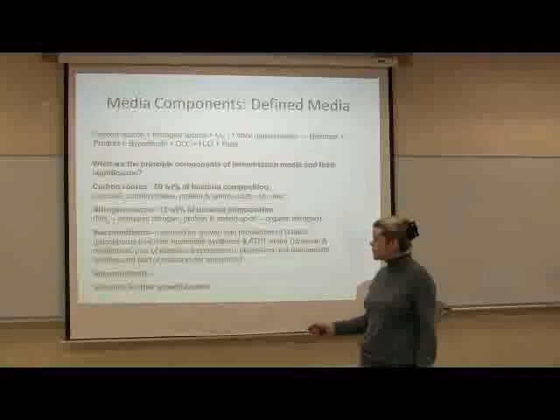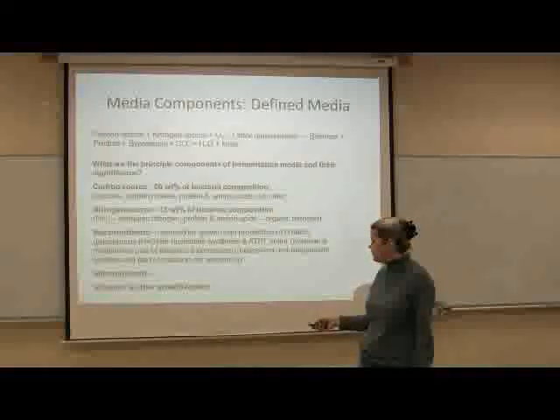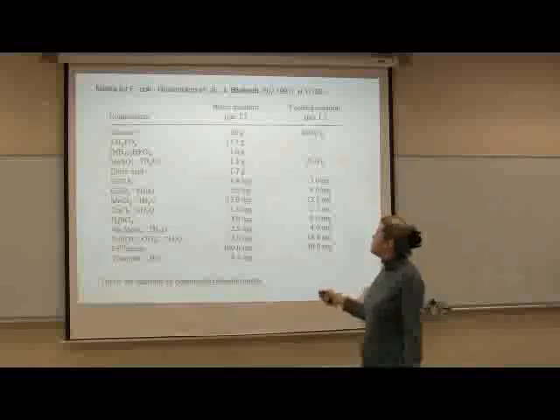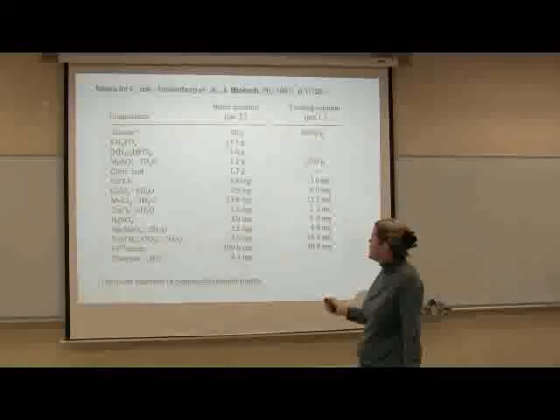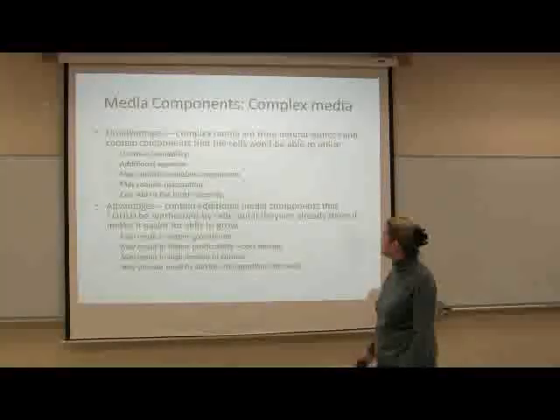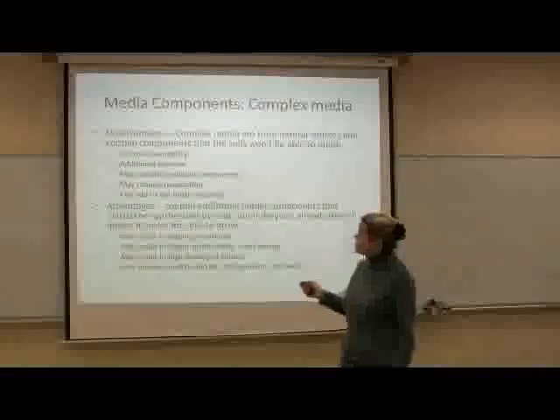But most bacteria need some vitamin. Not necessarily, they may be able to live without it. If they can synthesize all of their own, then they don't need them. But that's how it is. This is a typical medium. In the past, we made this media in this class. I had prepared the trace metals ahead of time, but I just decided we're not going to do it.